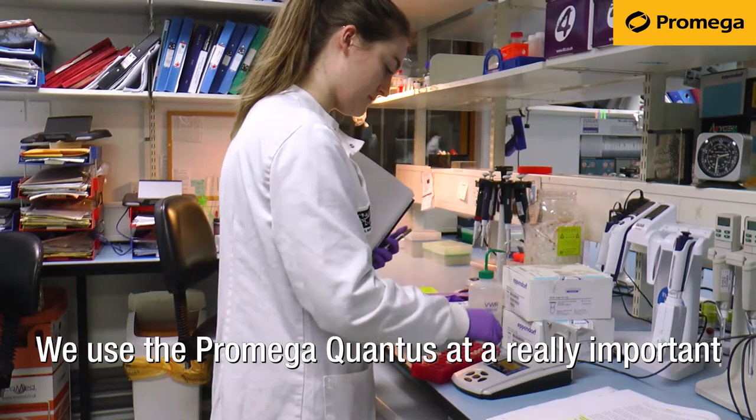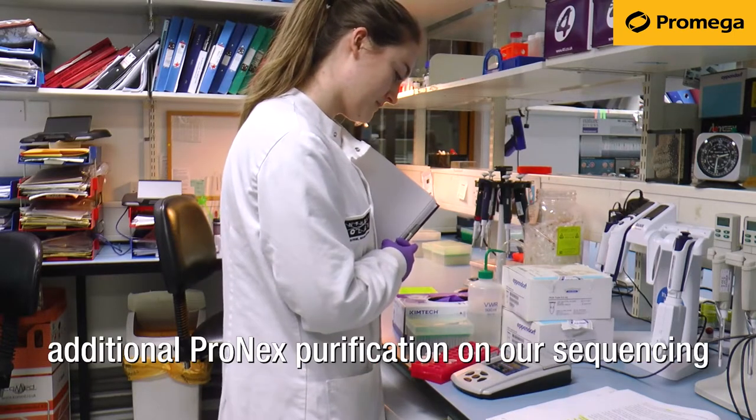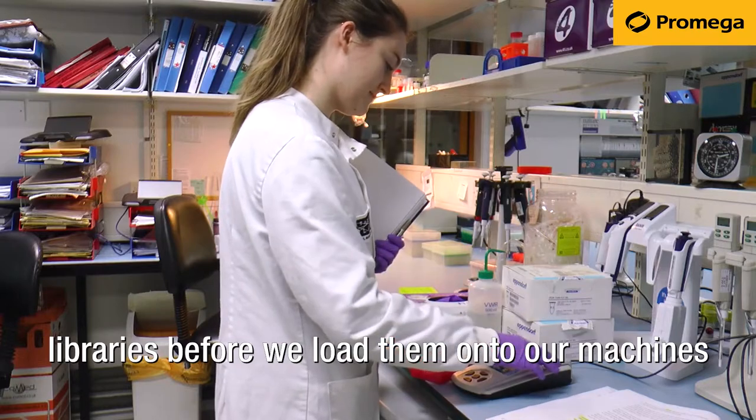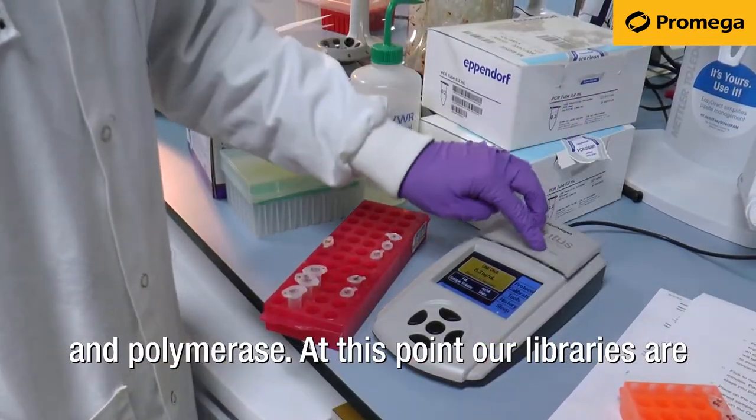We use the Promega Quantus at a really important step in our library process. We perform an additional ProNex purification on our sequencing libraries before we load them onto our machines, and this is to remove excess sequencing primer and polymerase.